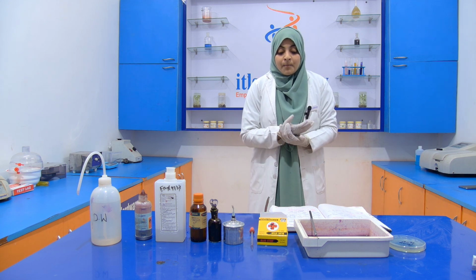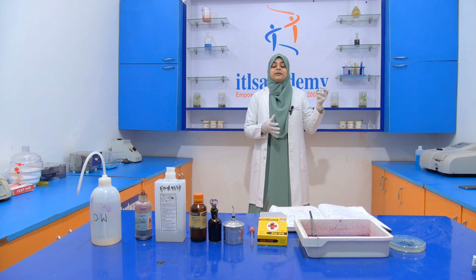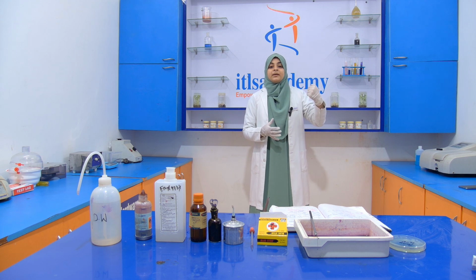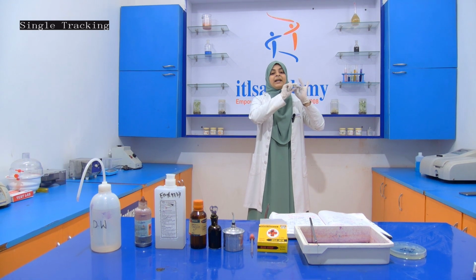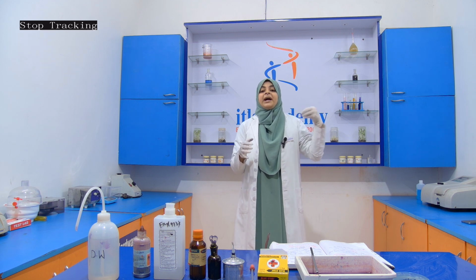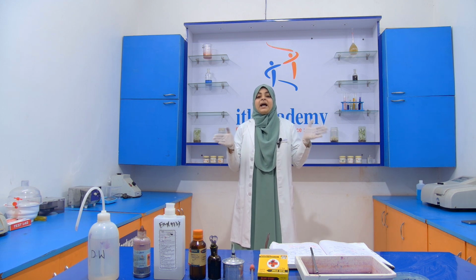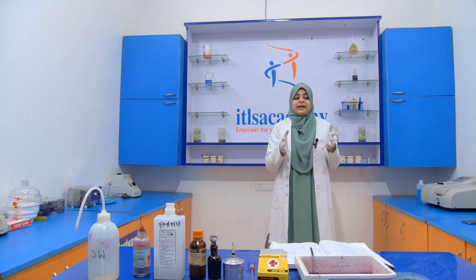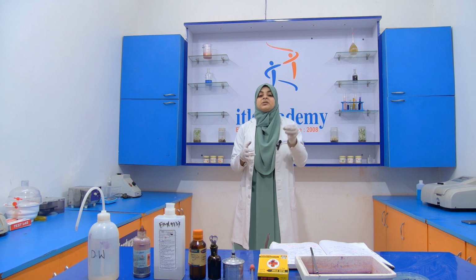Gram staining divides bacteria into two categories. One is gram positive bacteria and another is gram negative bacteria. Gram positive bacteria have a thick peptidoglycan layer, and gram negative bacteria have a thin peptidoglycan layer. When we perform this experiment, we use a primary stain, that is crystal violet.